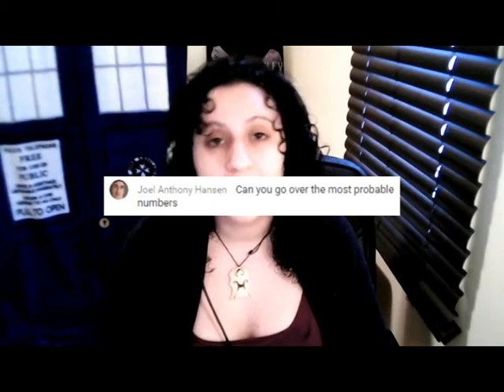I can't really explain the most probable numbers because it won't be very effective in this format, but I do recommend that you go into the section where we talked about brilliant green, 2-times brilliant green and 1-time brilliant green, or as I was referring to them, brilliant green and less brilliant green, and then look at the table on the next page so that you can understand your most probable numbers based on the number of positives that you got in each one of those tubes.